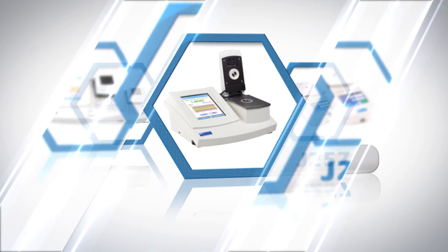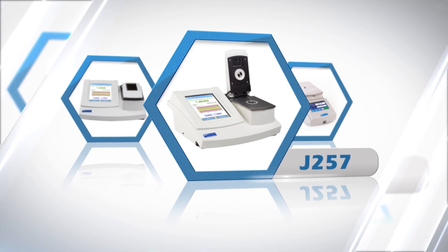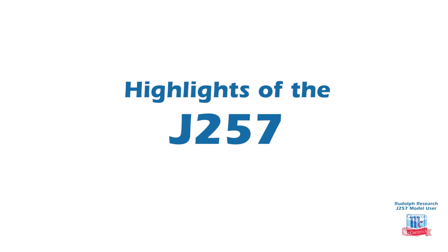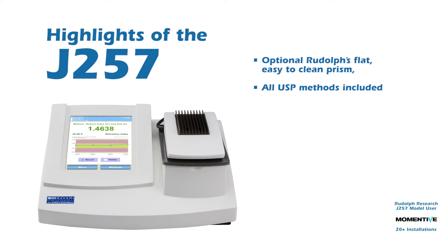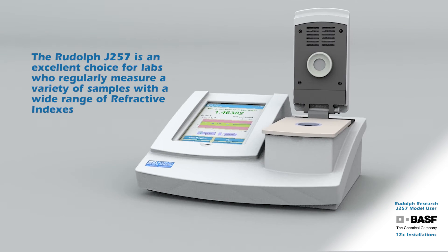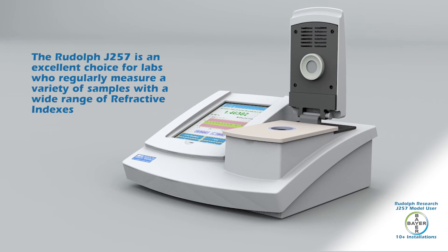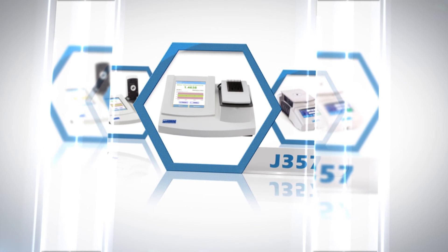The Rudolph J257 wide range refractometer offers high accuracy and the widest available measurement range for polymer, petroleum, chemical, and pharmaceutical labs. Highlights of the J257's features include Rudolph's flat, easy-to-clean prism, all USP methods included, Windows 7 embedded operating system, dual electronic temperature control, and advanced software features. The J257 is an excellent choice for labs that regularly measure a variety of samples with a wide range of refractive indexes.